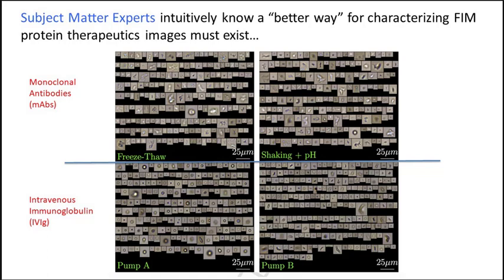Graduate students actually suffer through looking at these images, and they can actually intuit and figure out what some of the differences are. They can start to look at a large enough quantity of these images and make a best guess as to where they came from, but they have a very hard time quantitatively describing what features they're using to make their decision. But eventually, if they see enough images, they can just make a best intuitive guess without a very quantitative algorithmic description.